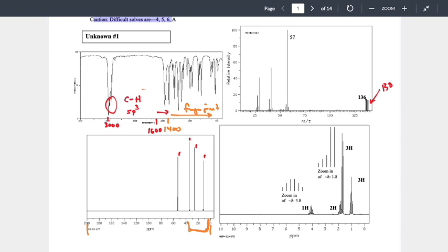Very, very low energy, right? But it's enough to disrupt how they see the magnetic field, and it takes them a certain amount of time to realign to the magnetic field. All of that gets monitored by our instrument, and what that gets turned into is the signals that we see out here.